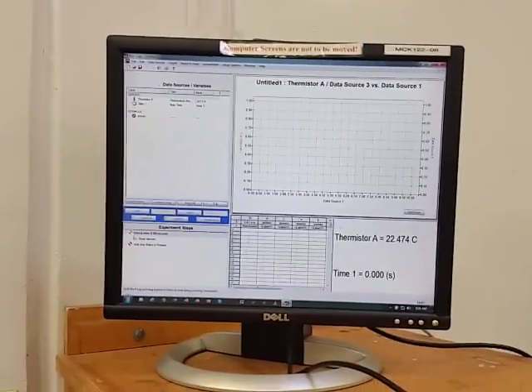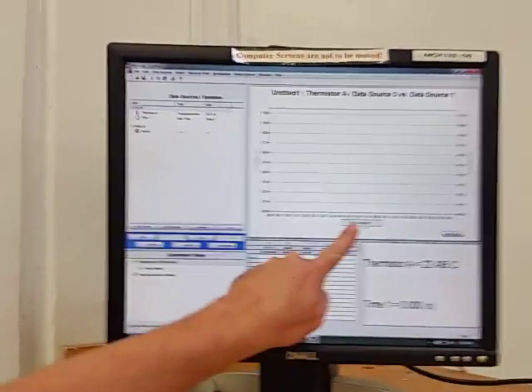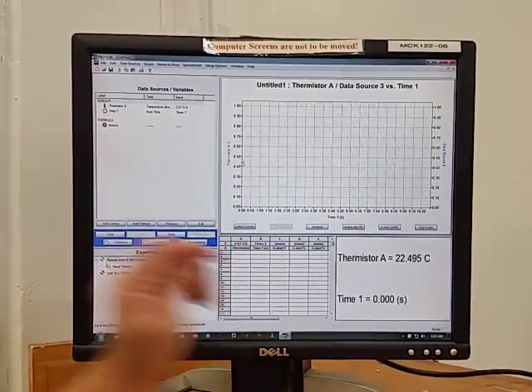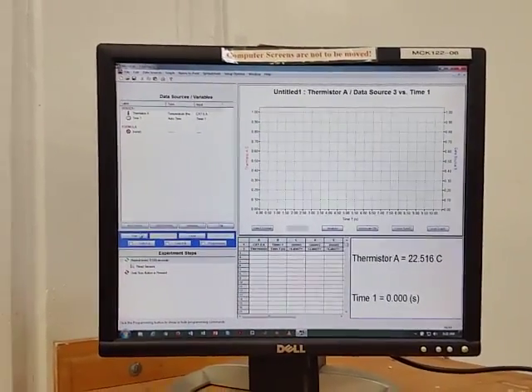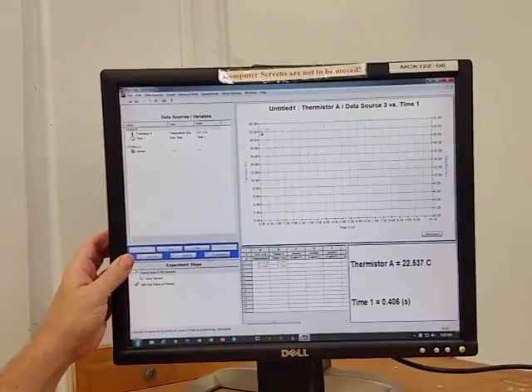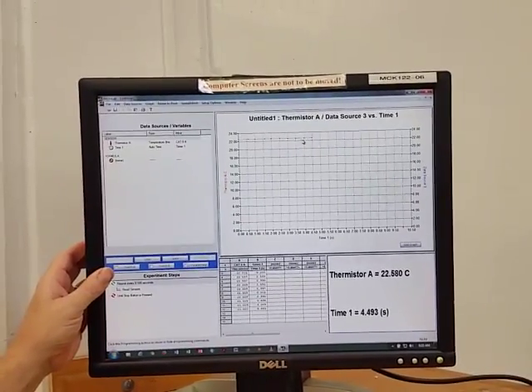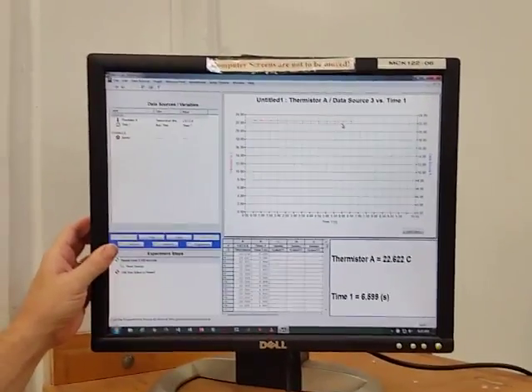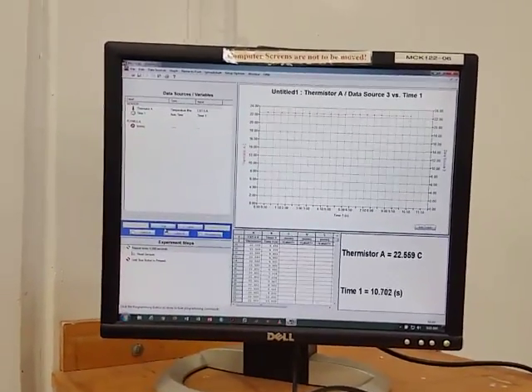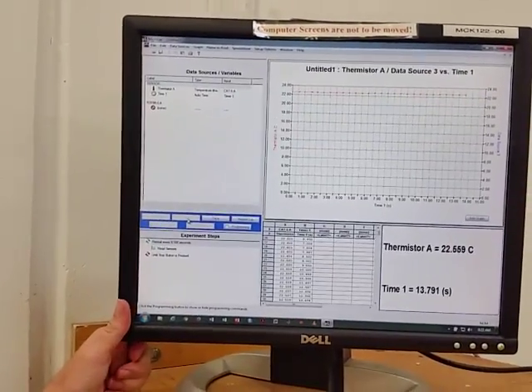All right. And that should be good. Now I can put the time up to here by dragging this up to there like that. And I can also drag it over to here. Now I'm ready to start. And I'll just do a quick practice here by pushing start. And you can see that it starts monitoring the temperature every half a second. All right? It looks like it's working okay. And then I can push stop here just as a practice to show how it works.